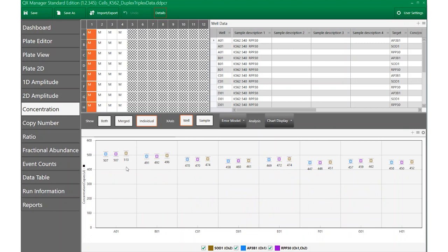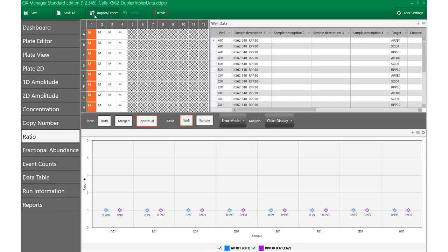Copies per microliter for total cells will come from the two reference assays, RPP30 and SOD1. The number of total cells per microliter determined by the two reference assays should be equal for each reaction. Linkage concentrations can be used to exclude any single positives caused by free-floating DNA.